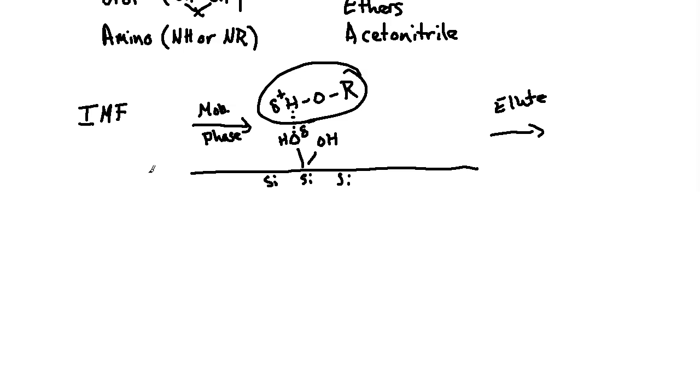Okay, so this is the action, the mechanism of action and how this works. Knowing this, it still stands that reverse phase and many of the ion phases that we mentioned at the beginning of this lecture are used over normal phase HPLC. They are the preferred methods as far as trying to deal with these sorts of separations, right?